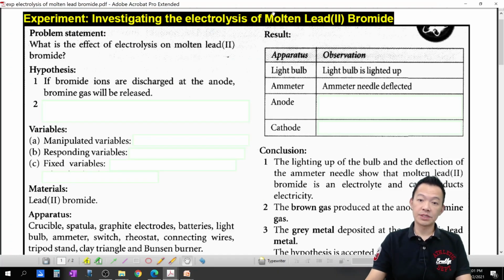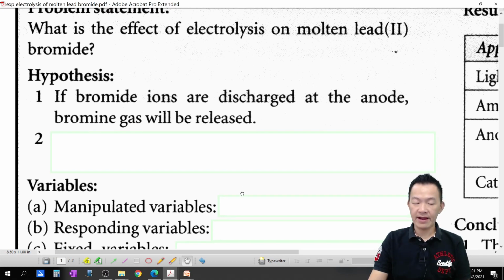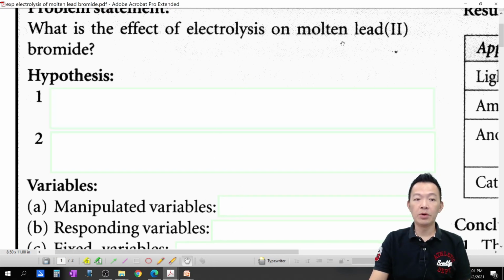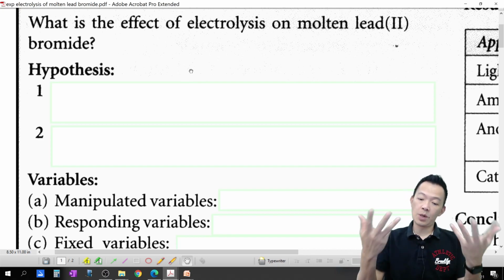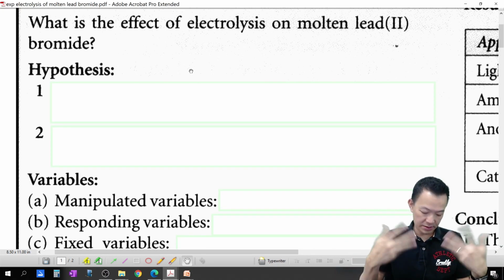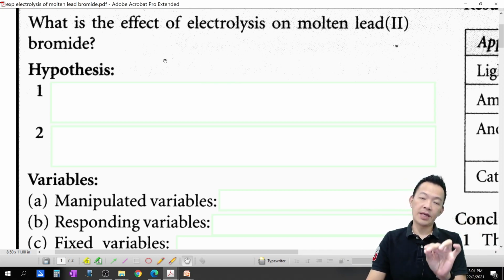我们填一点东西一下，小事来的。Okay. So what is the effect of electrolysis on the molten lead bromide? What is the effect of the electrolysis on the molten lead bromide? 把溶掉的 lead bromide 拿去做电解法，还有什么 effect 呢 ？Okay. So 你会看到什么情况呢 ？What are the products? 你会拿到什么东西呢？ So hypothesis, anode is going to get what?